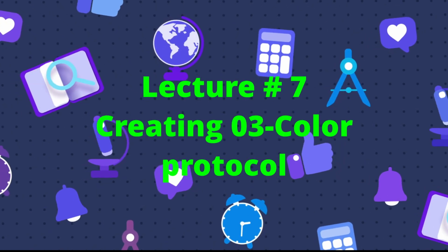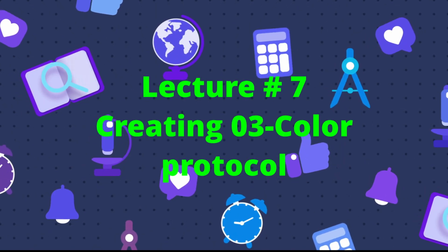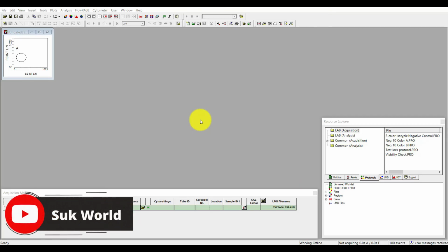In today's lecture, we will see how we can create a 3-color protocol for our flow cytometry.